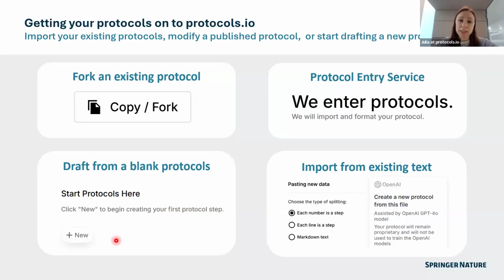What we also have, and is actually missing here, is AI assisted protocol generation as well. So that can help a little bit with getting you from a blank page to a loose draft that you will then be able to edit and build your protocol from. So I'll show that on the platform.